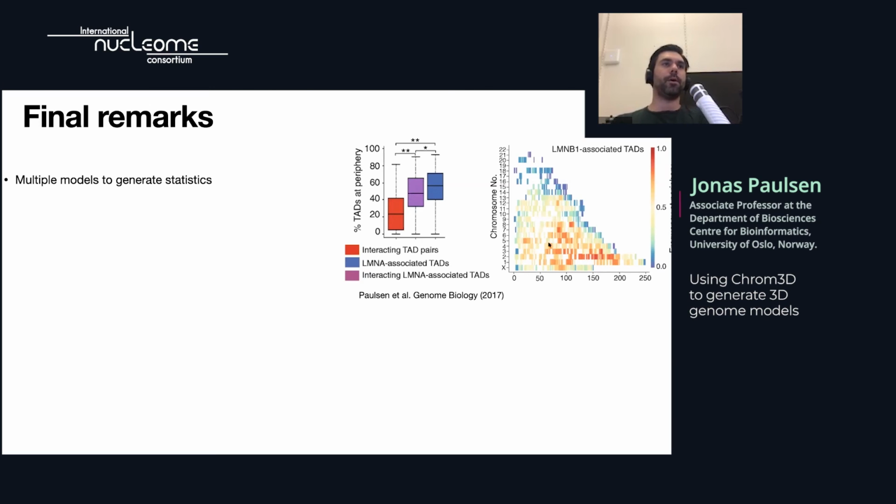This we have also touched upon. What if I only have Hi-C data? I don't have any information about LADs. You can simply skip this particular column in the GTrack file, and then Chrom3D will understand that you don't have LADs, and that's also possible.